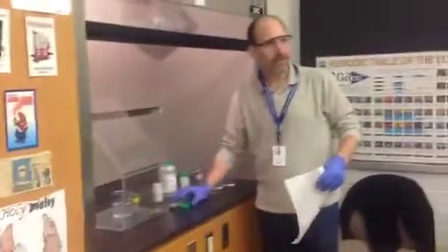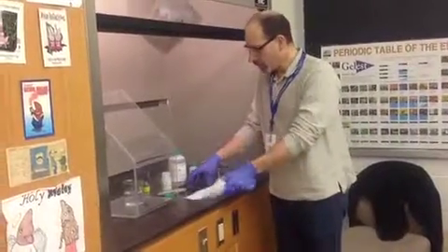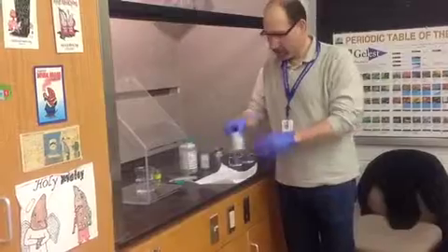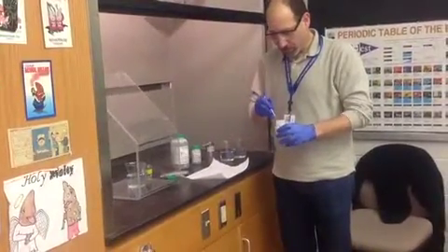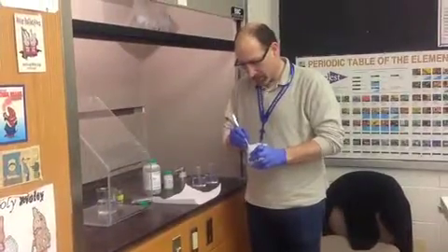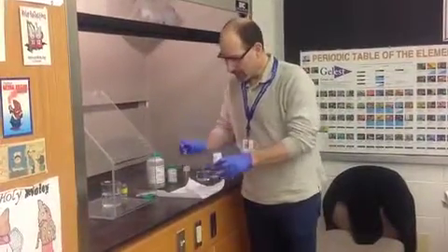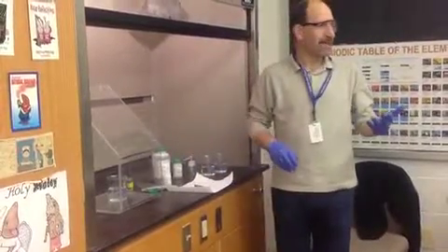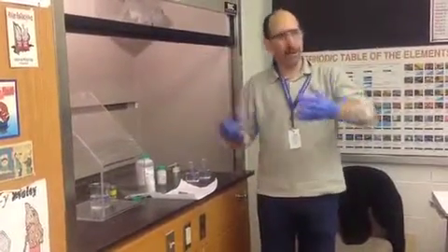They've all got how many valence electrons again? Just one valence electron. That one valence electron, it turns out, is relatively easy to pull off. In fact, water can pull off that valence electron. And so we store these under oil in order to keep them from reacting. I have to wear gloves because if I don't wear gloves, the water in my hands can react with the metals.